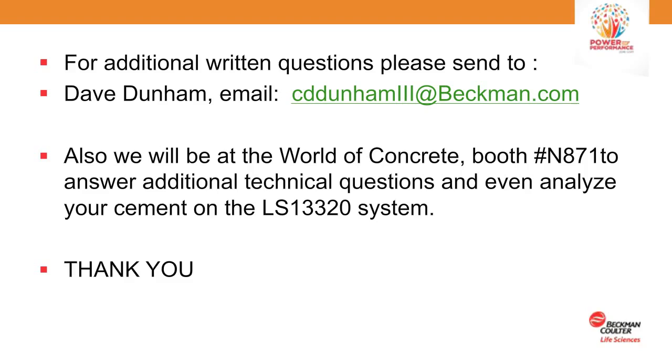Okay, that's great. We have another viewer who asks, could the tornado overcome the effects of trace amounts of liquid in the dry powder samples causing particles to stick together, such as oil or water vapor? Part of that's going to be dictated by how much water vapor we might have.